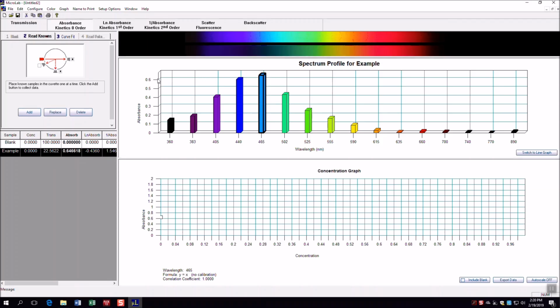So in this case, my absorbance is about 0.6466, which if we look at our graph, our axis on the y-axis, that seems about right to me. So that's how you'll do each of your samples. I'm not going to spend more time on that because at this point you're probably relatively familiar with performing the spectroscopy.